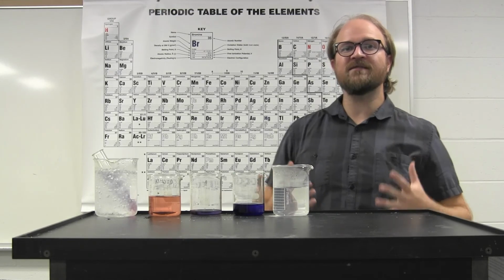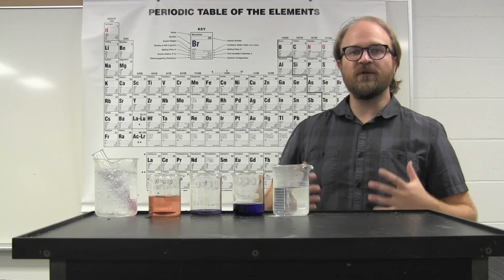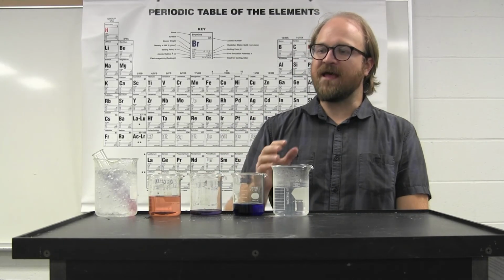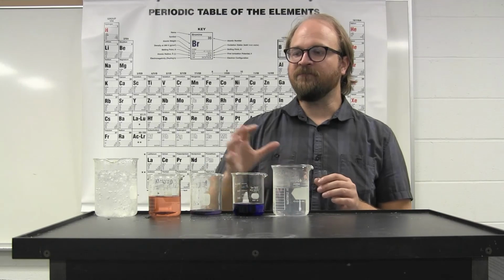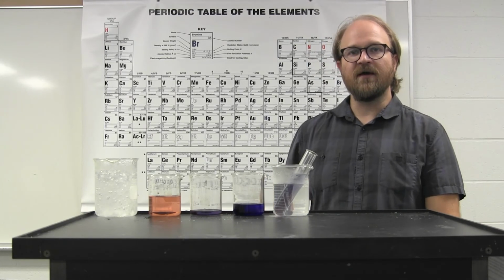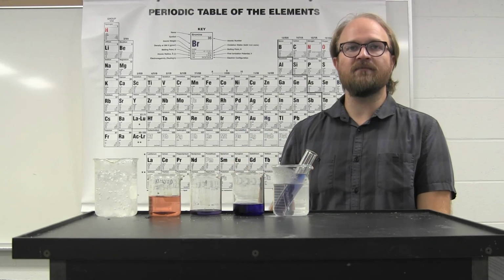This experiment combines a number of different concepts that you've gone over in Chemistry 2. It's taking an equilibrium reaction, which is prepared using different moles and different ratios, and you're determining the equilibrium of this at different temperatures. You're looking at the ratio of product and reactant at these different temperatures, and from the change in the equilibrium constant, you can then calculate the enthalpy and entropy, and overall you can see at what temperature this reaction would become spontaneous.